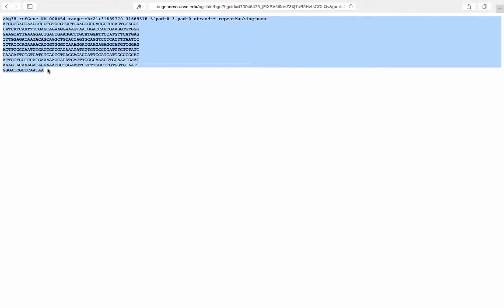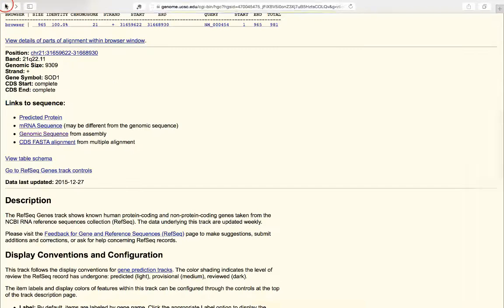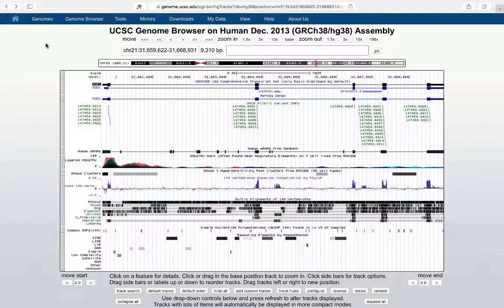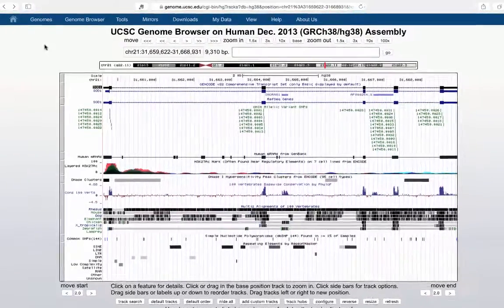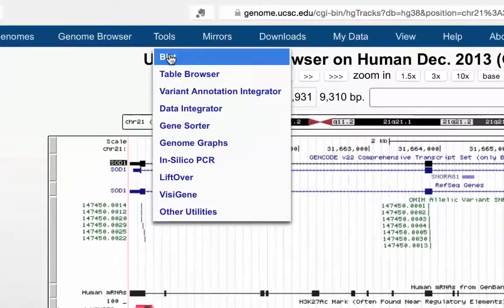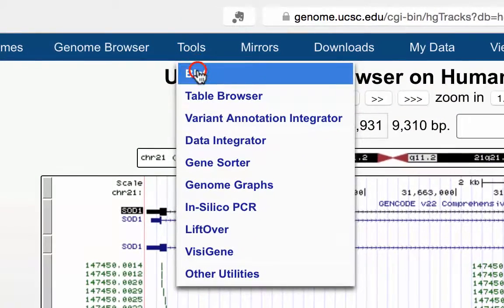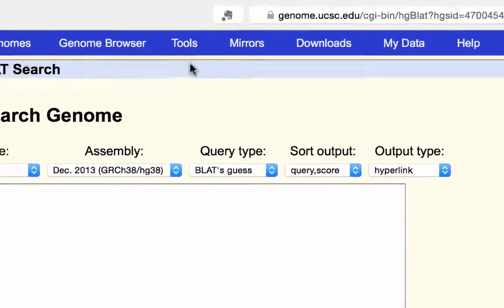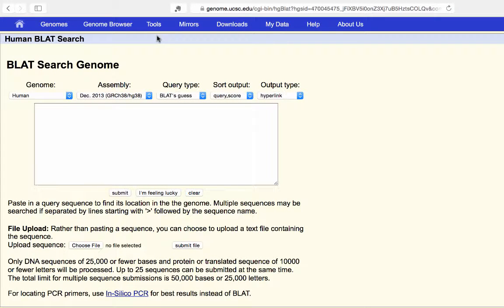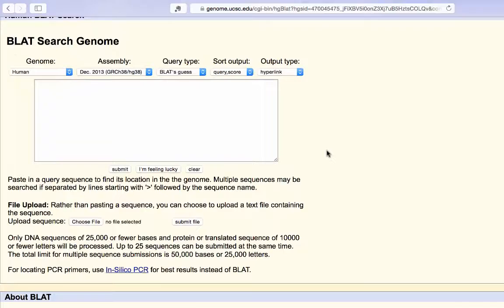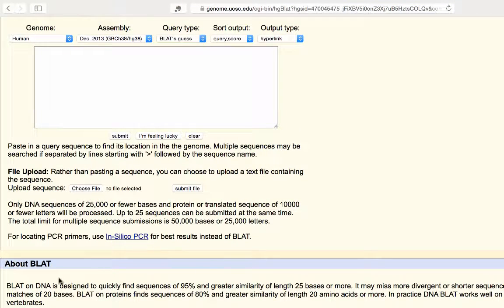I'll go ahead and select that sequence and copy it, then navigate back to the genome browser. That's how you get DNA for sequences you're interested in. Now if you want to search that DNA, you use the BLAT tool, found under the Tools menu as the first option. BLAT is designed to quickly find sequences of 95% or greater similarity of length 25 bases or more.